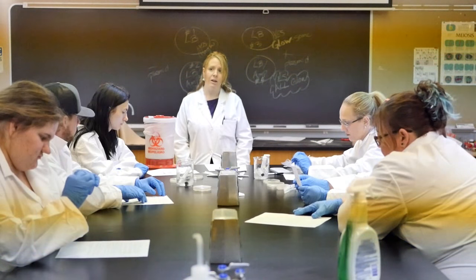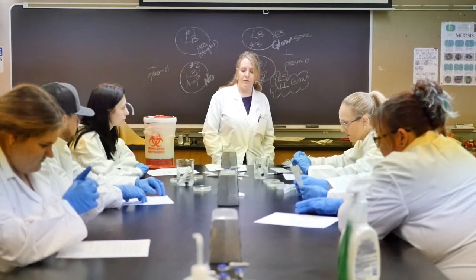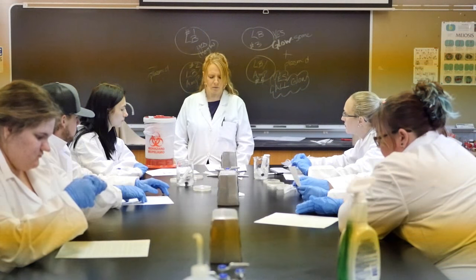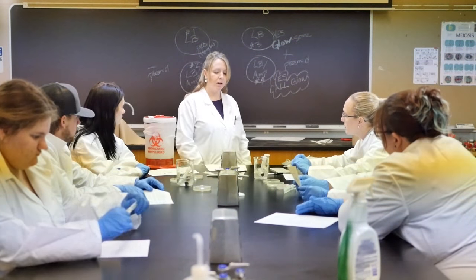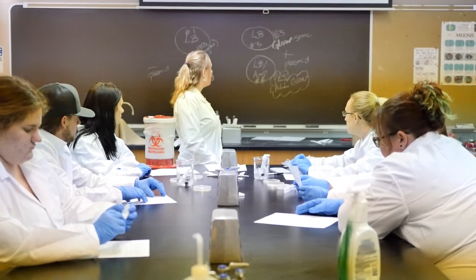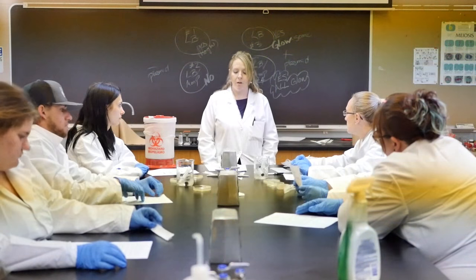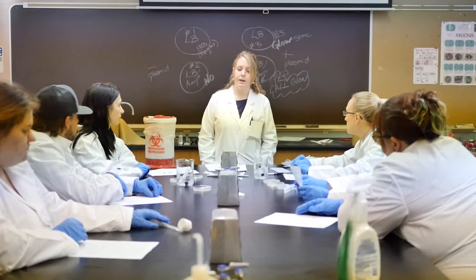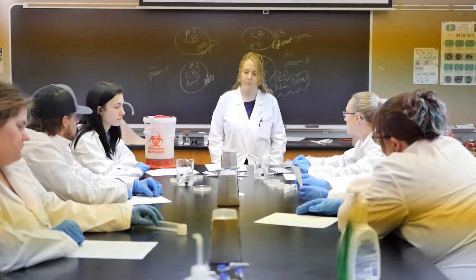And then we will put them in the incubator after we get them all nice and spread out over the whole surface, and we'll give them about 48 hours at 30 degrees Celsius to incubate. So tomorrow we may or may not be able to see some glowing on plate number 4, which should have all glowing. We might be able to see some on number 3, so tomorrow at the very earliest. Otherwise, we should be able to see some pretty good glowing and good growth at 48 hours, so on Friday. So come back and see me on Friday because it should look phenomenal then.